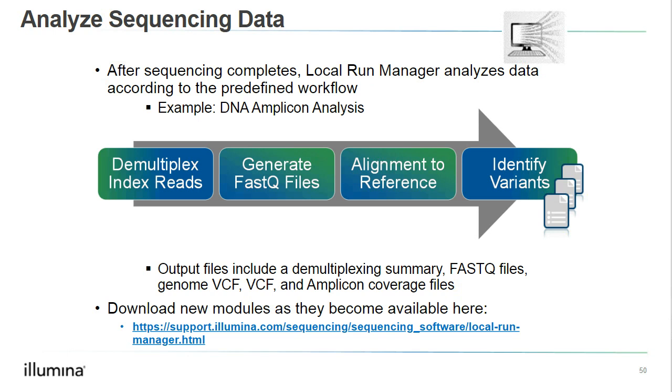Your output files will vary depending on module, and again, new modules will be released to the support site, and we recommend using the module selector tool to find the one that you need.